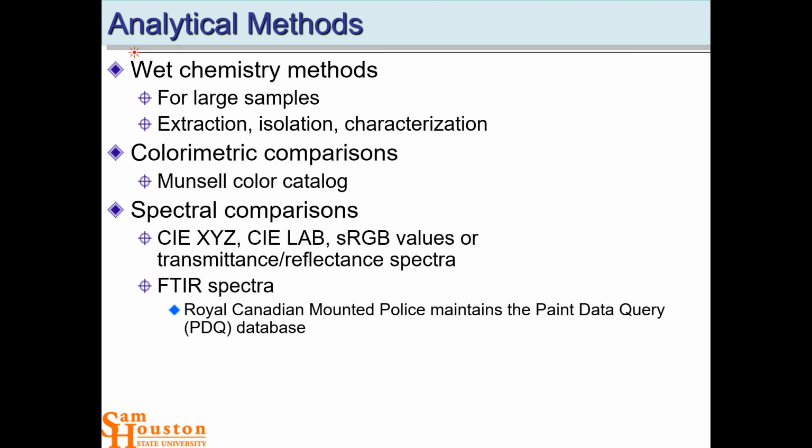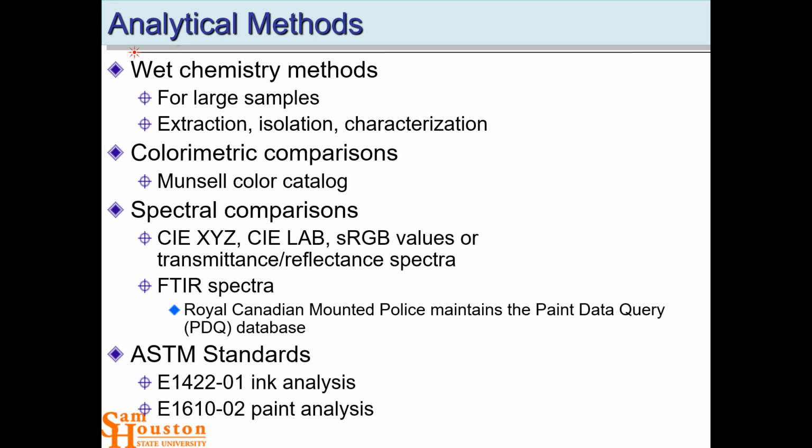But now they're making infrared multi-array detectors. So you can just take a single shot. Basically, you're doing 64 by 64 spectra at the same time. So you put your sample in there and you can image a grid that's 64 by 64. Not great high resolution, but it may be enough for the analysis that you want to do.